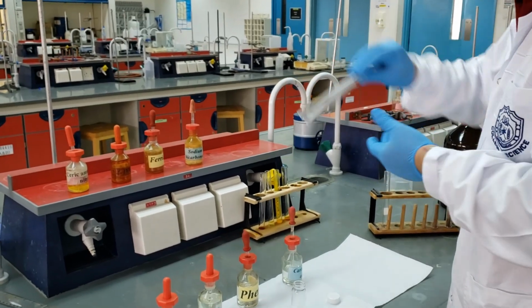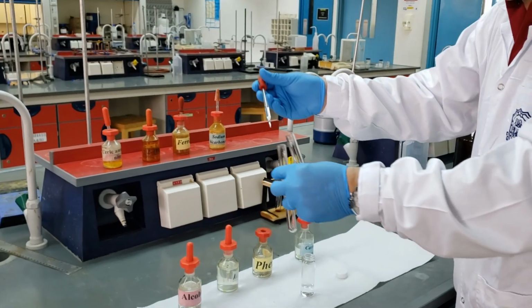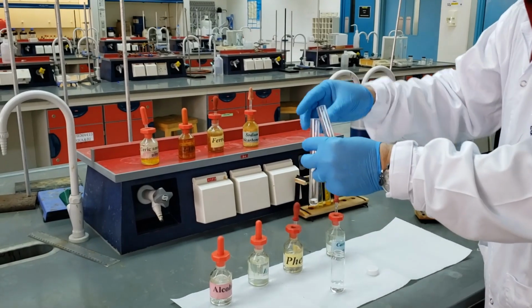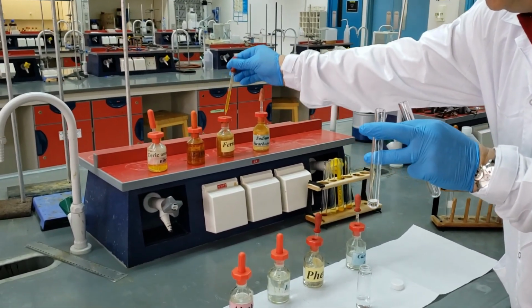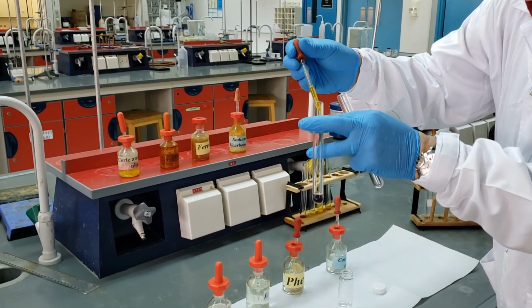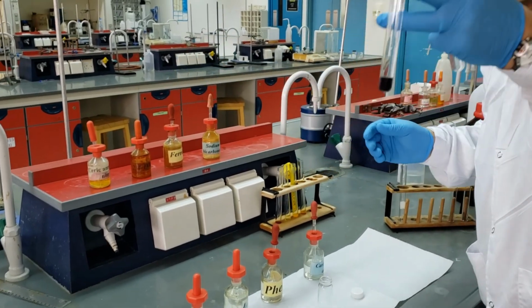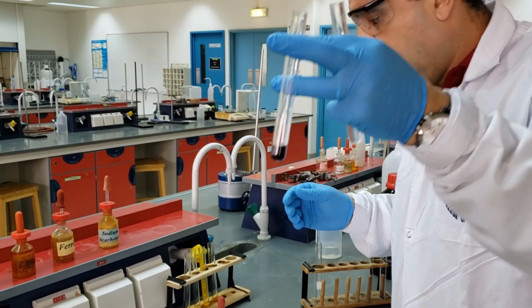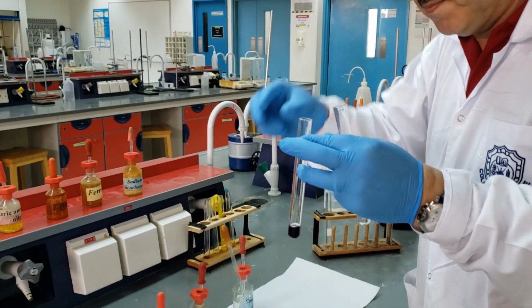So we go for the next test, which is the phenol chemical test. Again, we start with the known one, which is phenol, and then we add its reagent, a few drops of ferric chloride, and then we have a very distinct violet color in this case. Now we check for our unknown compound.